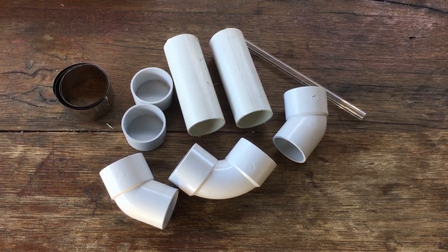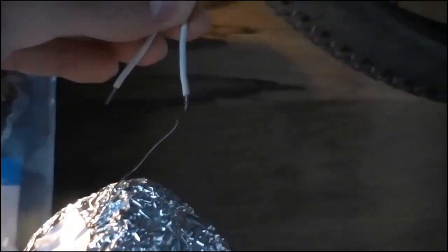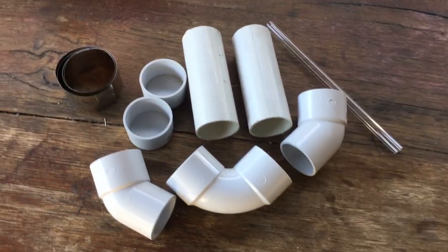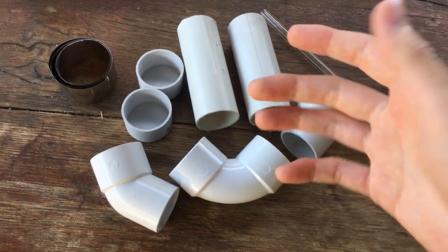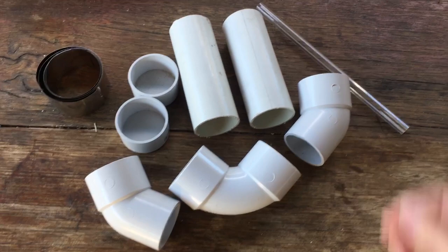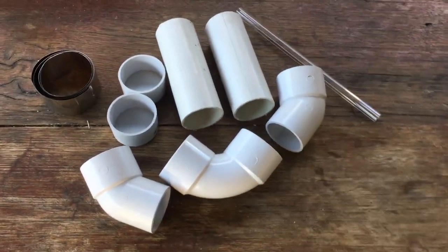Hi guys, Harry here. Welcome to Scrap Science. So if you've been watching the channel at all, you'll know that my favourite thing is electrolysis. And today we're going to have a go at the classic electrolysis experiment separating hydrogen and oxygen from water.